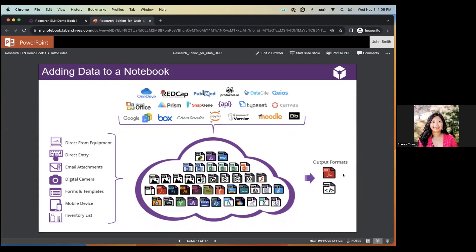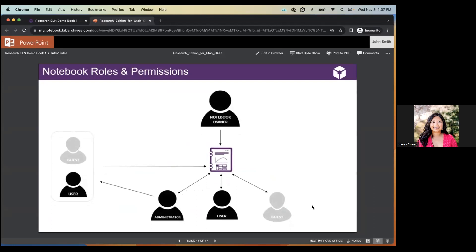In Lab Archives, every notebook has one of four access roles. The owner is the highest access role — each notebook has just one owner, typically the PI, director, or project lead. The owner can give others access as administrator, user, or guest. Guest is the lowest access role, shown in gray, and by default has read-only rights. You can grant a guest edit rights, but the notebook reverts to view-only for them after 60 days. Guests are typically external collaborators, interns, or sometimes undergraduate students.